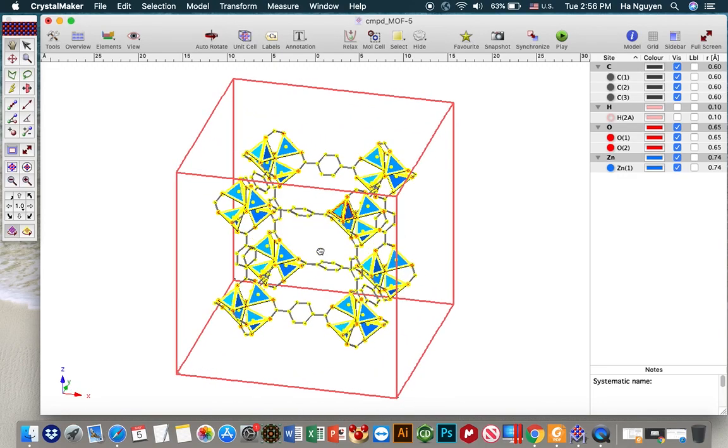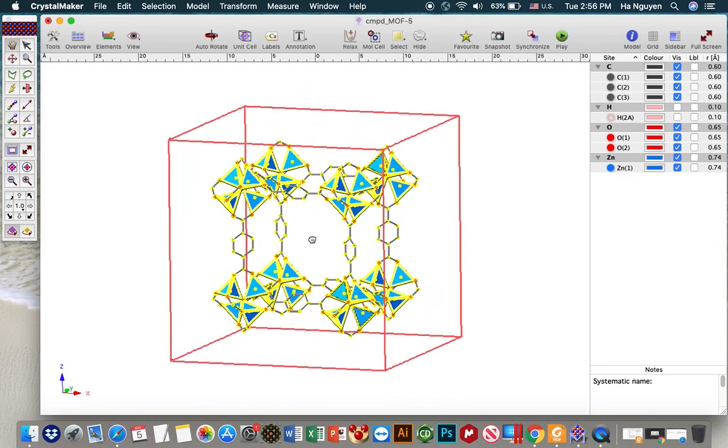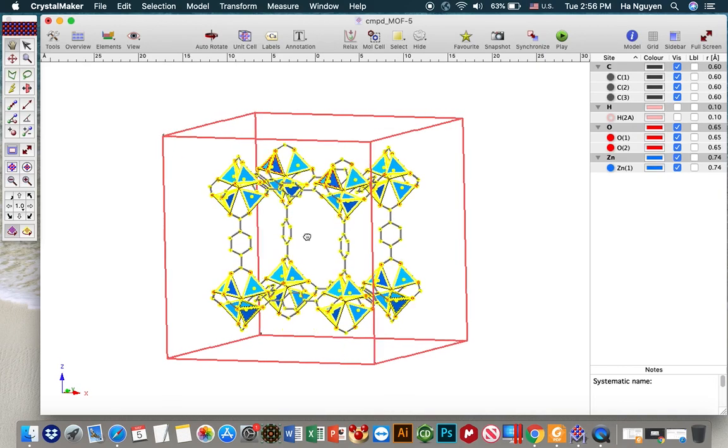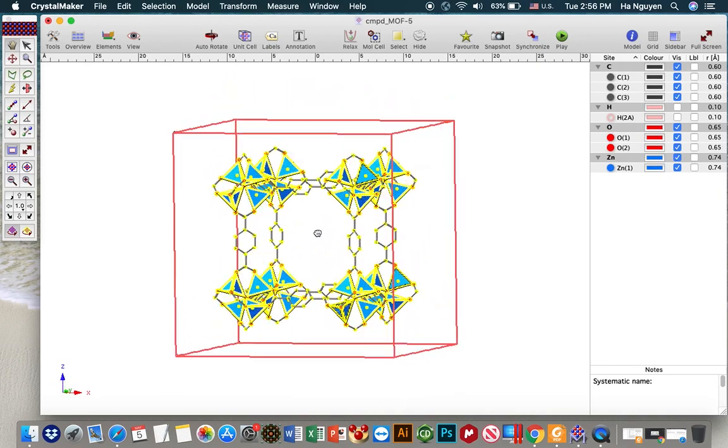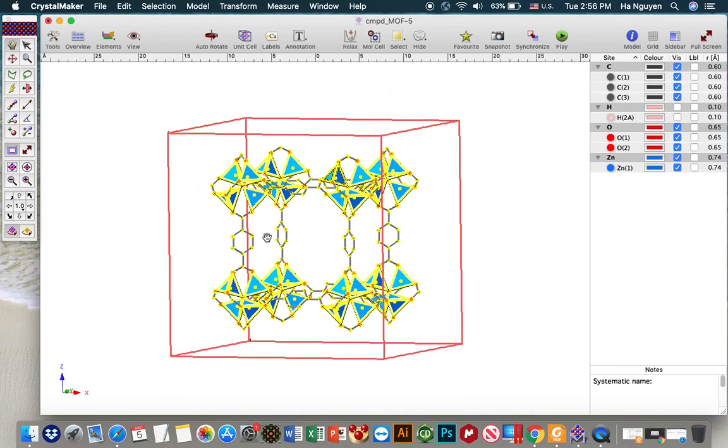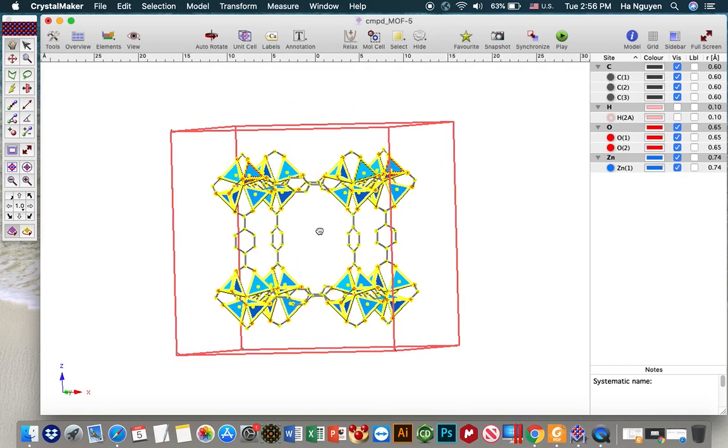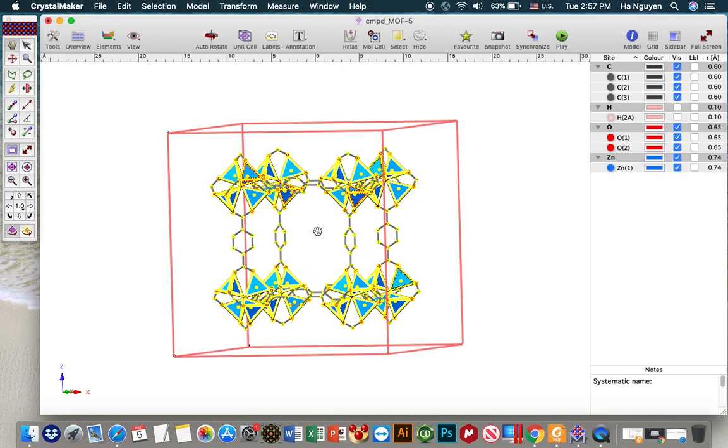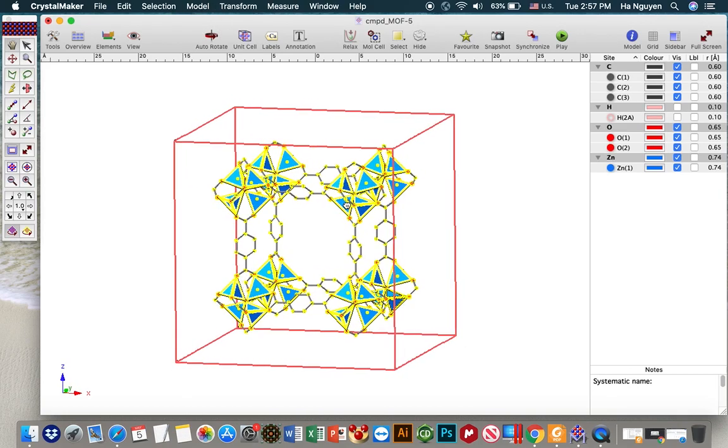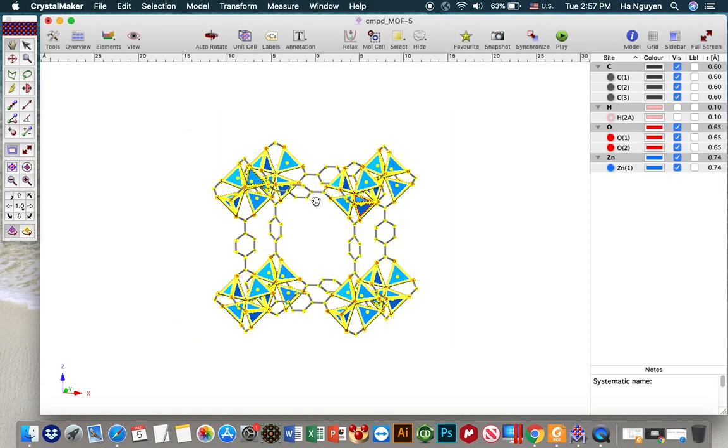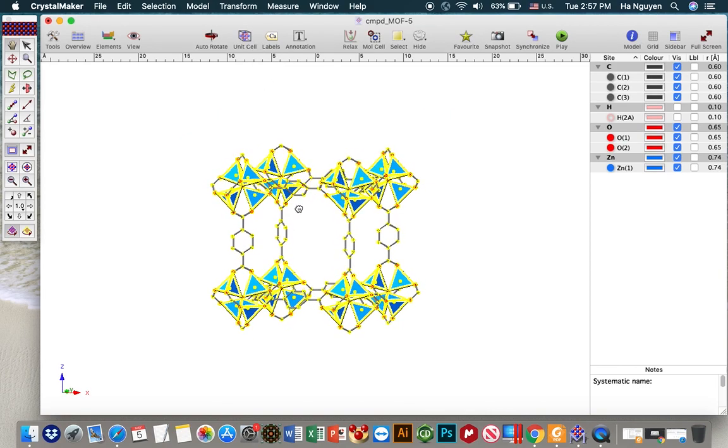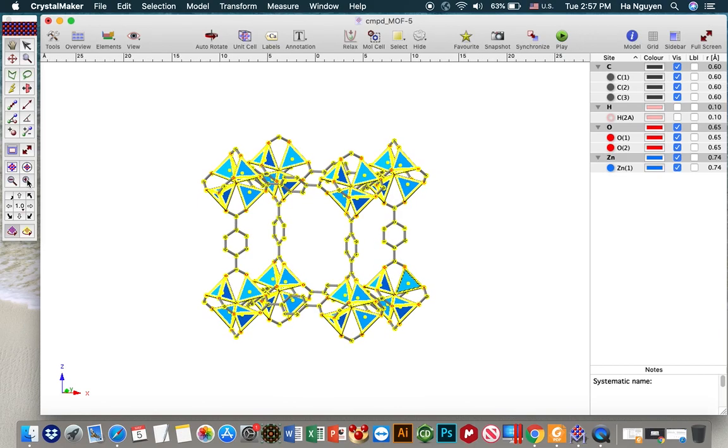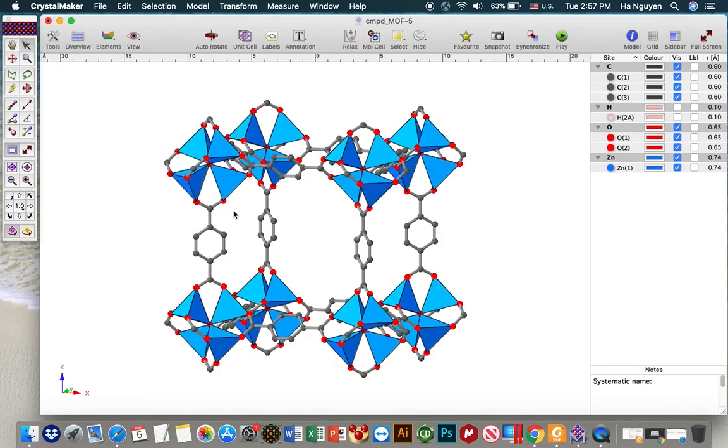The one consists from the phenyl ring, from the phenyl rings pointing towards each other. So let me hide the unit cell to make it clearer. So here is only one cage, the smaller one.